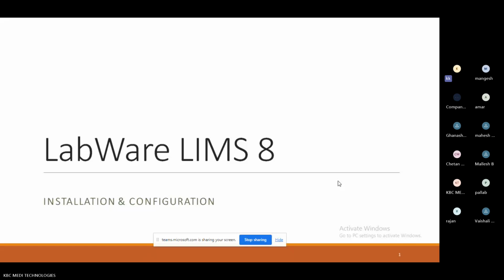Okay. And I need to tell you one thing before starting further discussion. During the demo, today I am just using PPTs. We have different types of modules, and for every module I'm going to use a PPT presentation for today's demo. But when we discuss real-time training, I'm going to discuss along with the application, not by using PPT.